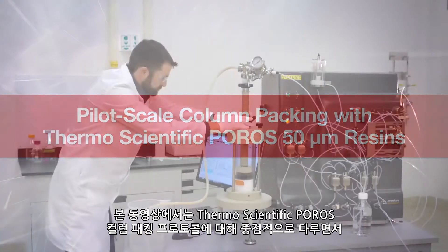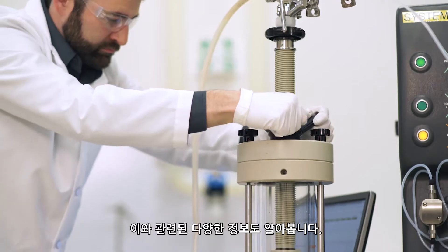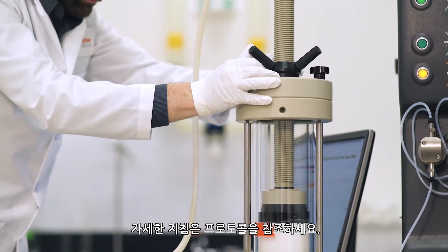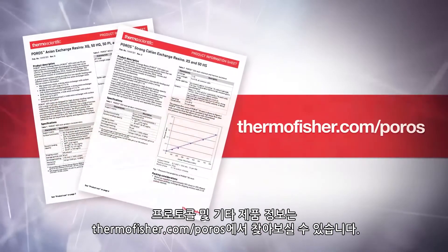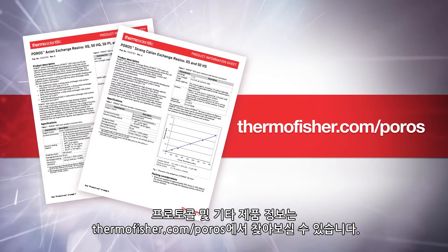This video highlights and expands upon the Thermo Scientific Poros column packing protocols. Please refer to the protocols for detailed instructions. Protocols and other product information can be found at thermofisher.com/poros.